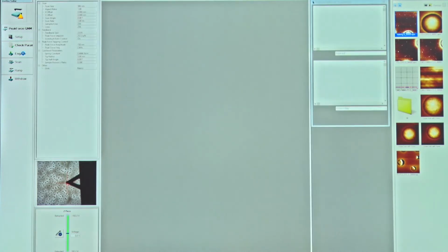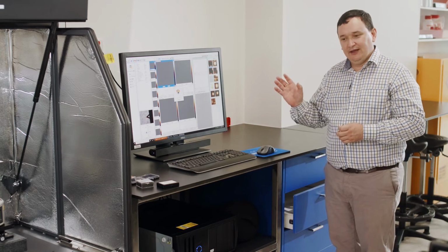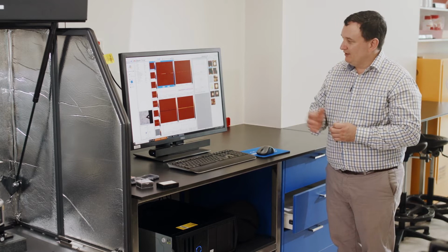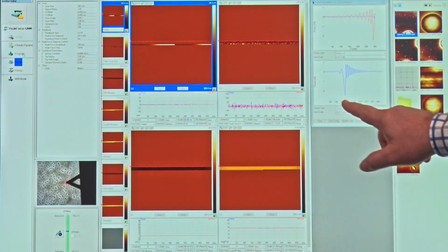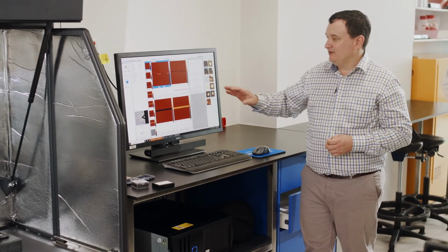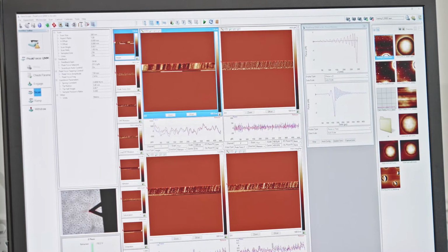Okay, so let's engage. Again, we'll land on the sample surface. We start the peak force cycle, which you will hear as a kind of high pitch in the background. We land against the sample surface, and we know we're touching because we can see the interaction of the probe against the surface. Now, Scan Assist is turned on, so it automatically adjusts the parameters in order to give us an image eventually, which we will get here, like this. So we start to see some imaging of the surface.